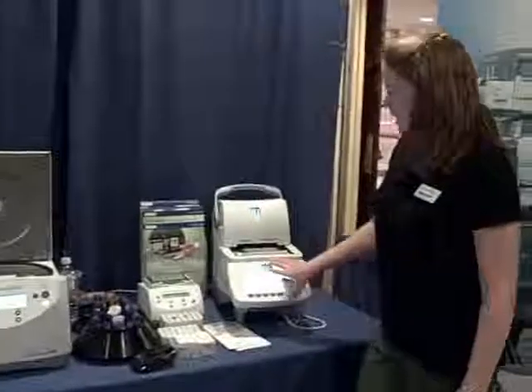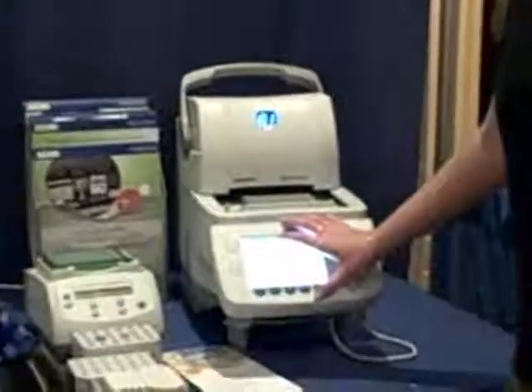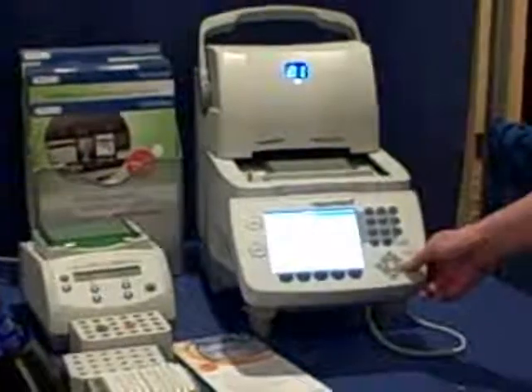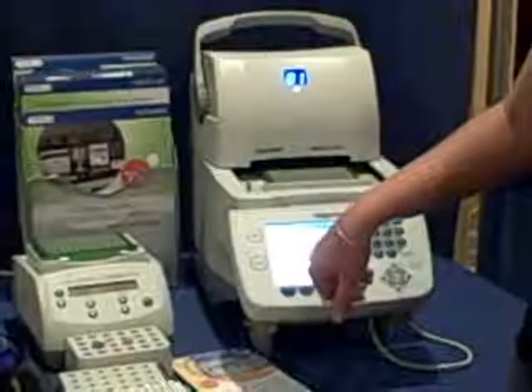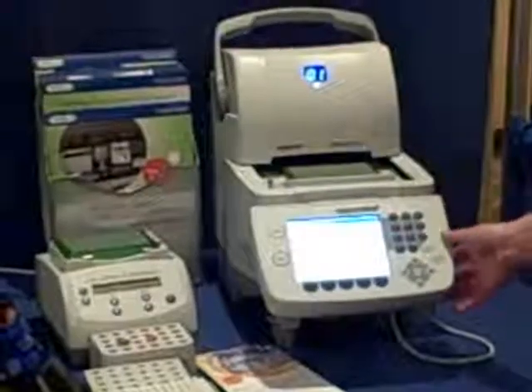The other thing is, you can see from the screen — very nice, large, easy to see, easy to program. You just scroll across and change whatever you want to change on it. Each person can actually have their own usernames and folders, just like any kind of Windows-based system. So it makes it very easy to program.